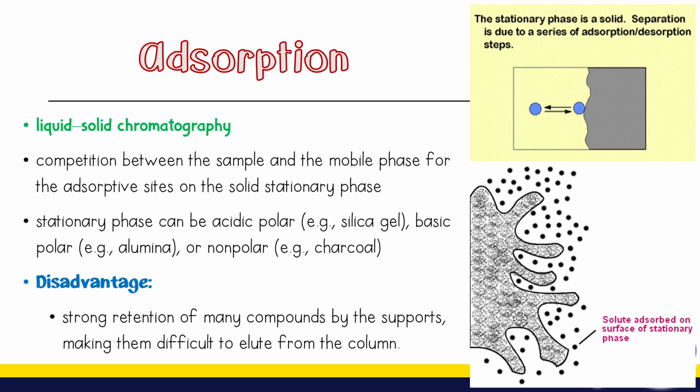So, as you can see in this image, these are examples of your adsorption techniques. Again, the different components of your analytes carry different structures and interactions, thus affecting their adherence to your stationary phase. So to further explain how adsorption chromatography works, let us watch this video.